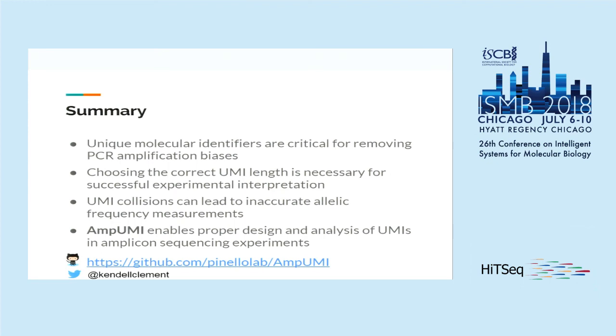Nowadays people are using two UMIs on two ends of the fragment. Do you have a way to also incorporate that into the design or the collision calculation? That's right. So in the design phase, you would simply take the sum of the UMI lengths, and that would be the input for this program. In the analysis step, it is possible to chop UMIs off of both ends. So yes.